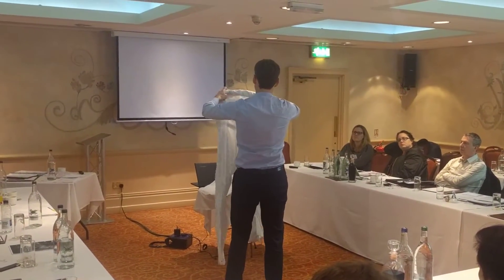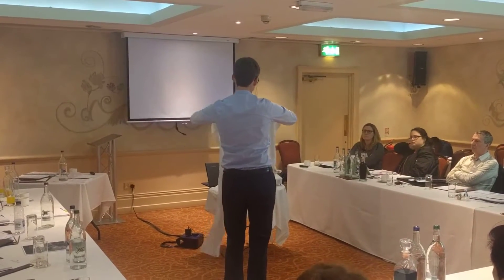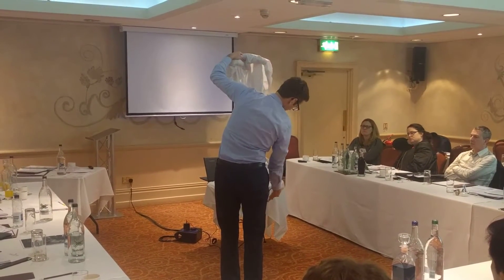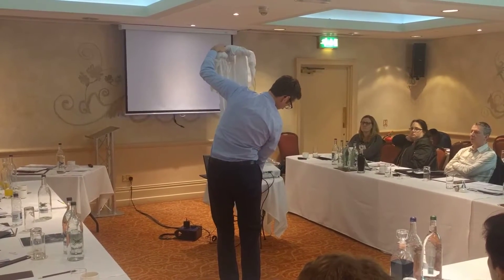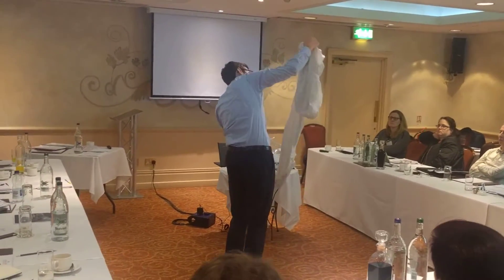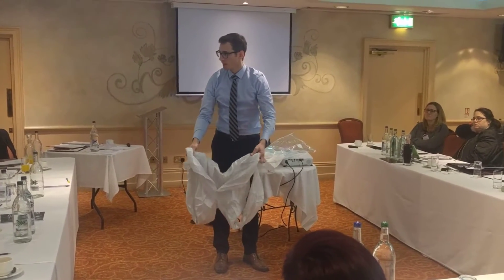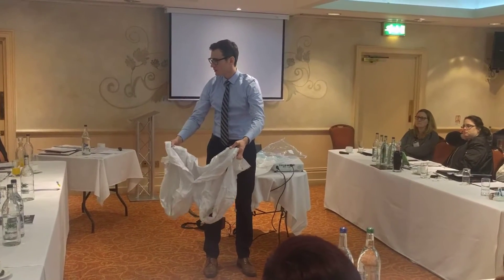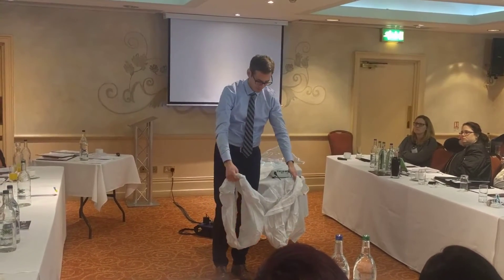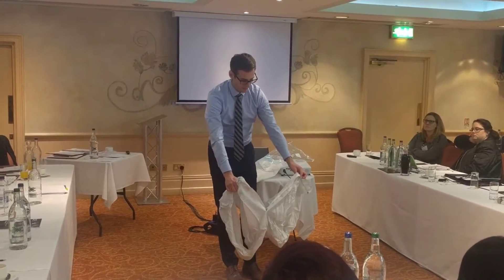I roll it like this until I reach the height of the belt. Then I take the leg, put it here, take the second leg, right here. I can take better control of what happens with my sleeves especially, which are more critical than the legs which are tucked into the boots. And the broader I'm taking that, the lower I can get to step in with my feet.